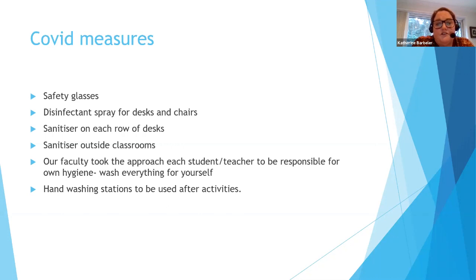In terms of touching the equipment, we've again adopted the strategy that if you use the equipment, you clean it and you put it back clean, and then wash your hands very well afterwards.